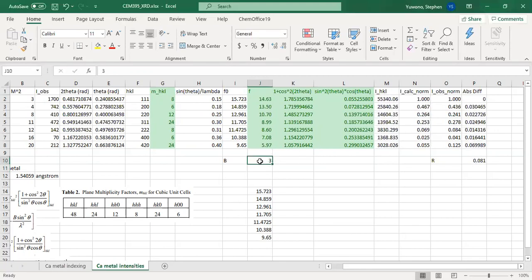So it looks like the right value is between 1.5 and 3. And of course, you can scan it a little more carefully, 1 by 1, 0.1 by 0.1, and then 0.01, and then decreasing your threshold. But we can automate it with the Solver. So let's start with 1.5 because that's the value that we had.